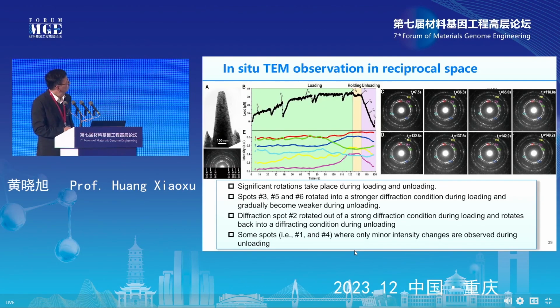Anyway, during the loading process, if the intensity change means orientation change, then of course crystal rotation will occur, and it all changes in different ways. That's something we should observe. And during this holding process, of course, nothing really happened.